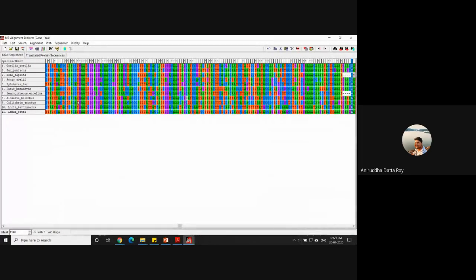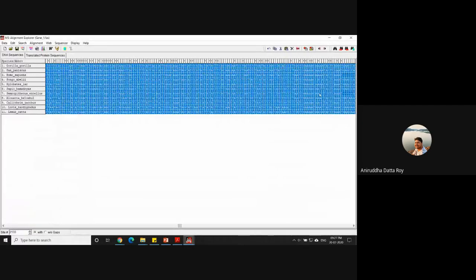So my first gene is from base number 1 to 1140. And my second gene is 993 base pairs long, so therefore it will be 1141 to 2133. Okay, so you have to make sure you have that information.